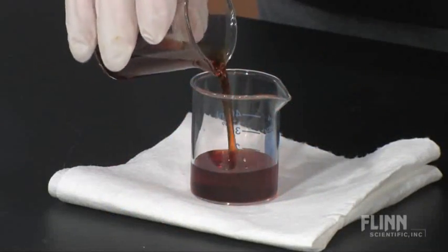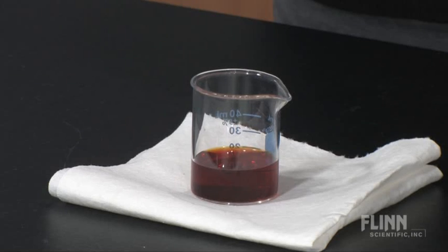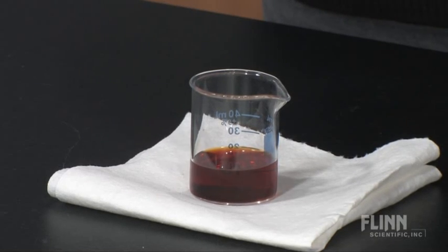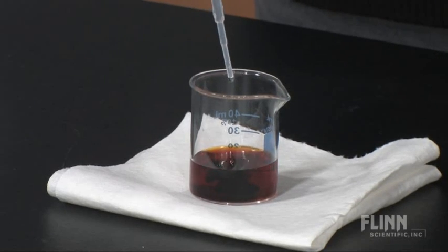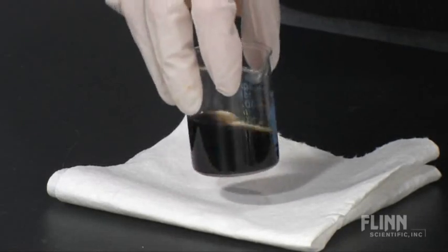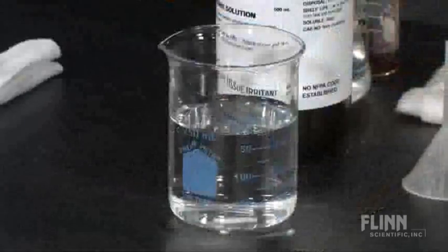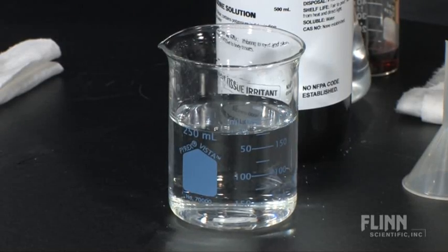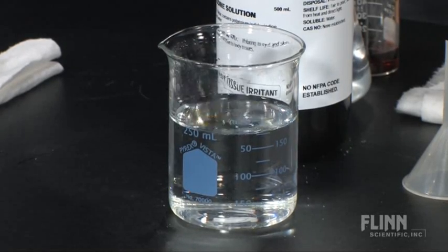To demonstrate dialysis tubing at work, we can conduct a simple experiment using the characteristic reaction of starch and iodine. When starch and iodine react with each other, they form a characteristic blue-black color. We start by filling a beaker with distilled water and add a small amount of iodine.